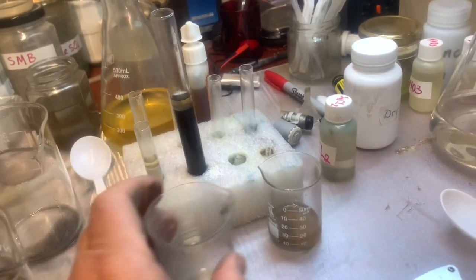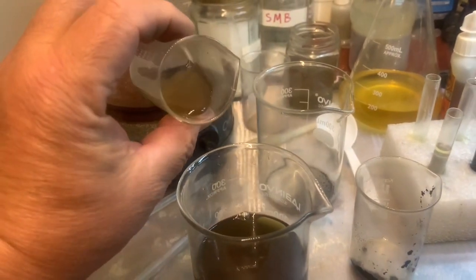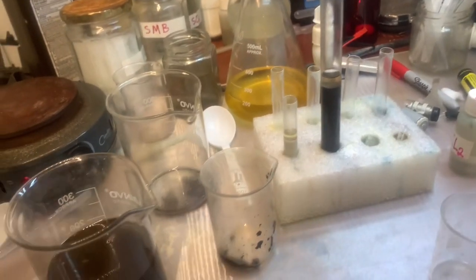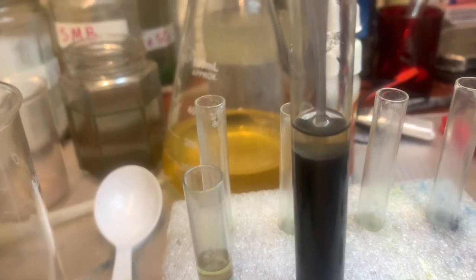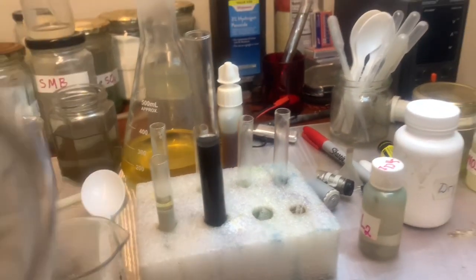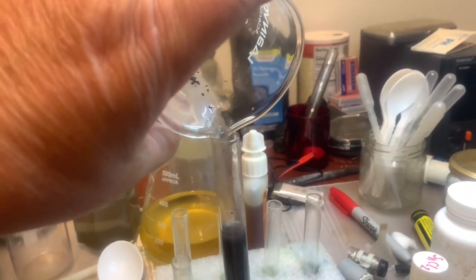And here, what we have still on the bottom, we have some gold too. So taking that juice out too. Okay, putting everything together, and here we still have settled down some colloidal gold. So I'm taking that juice out and adding all this stuff. Okay, so it's not so clean, but it's okay.